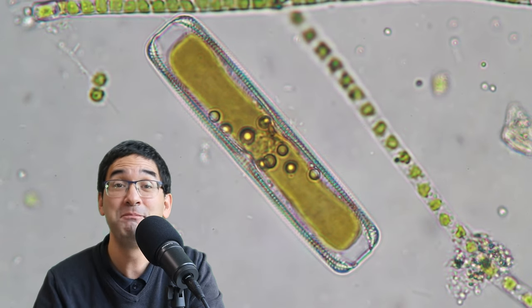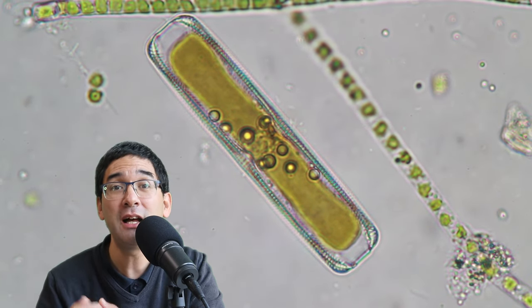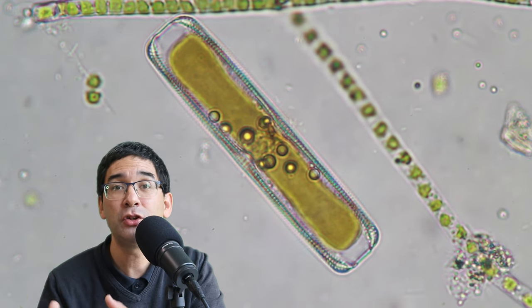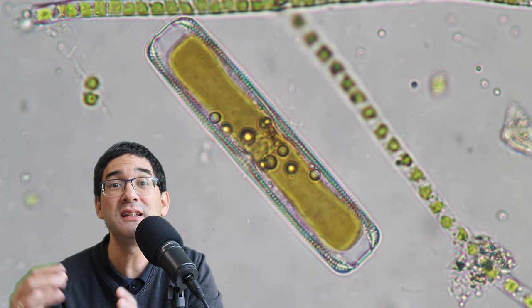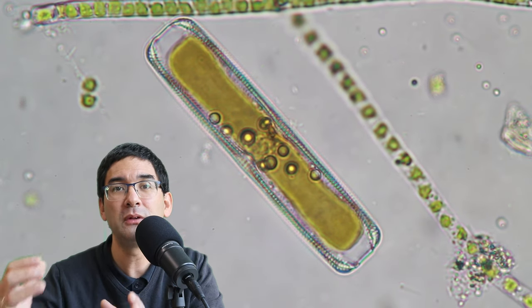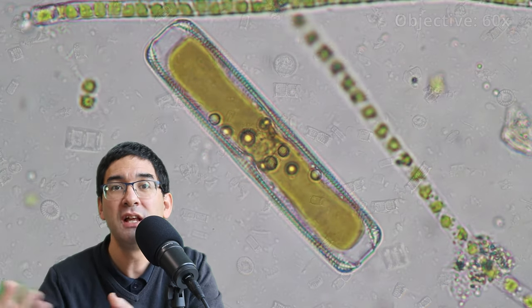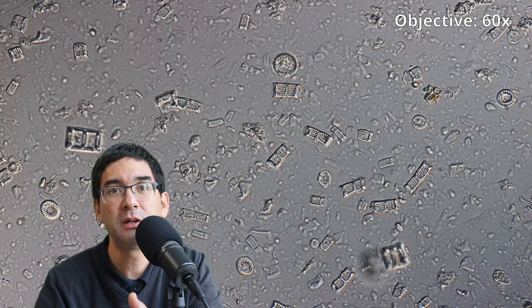How do you do that? Well, that is a little bit dangerous. You have to use hydrogen peroxide and the hydrogen peroxide will oxidize and remove all of the organic substances. And what is left over are those beautiful diatom cell walls, where you can make a permanent mount of them. And then they store for a very long time.